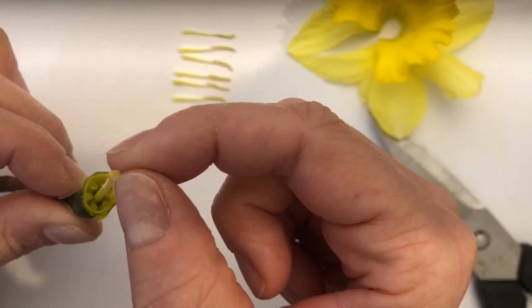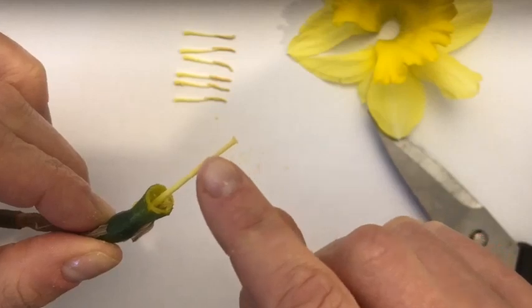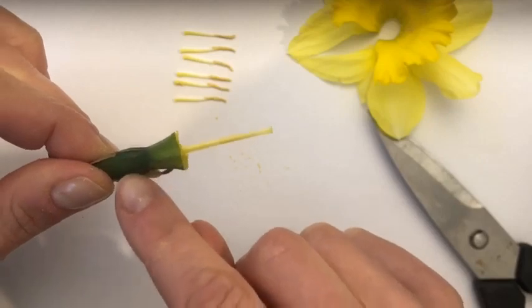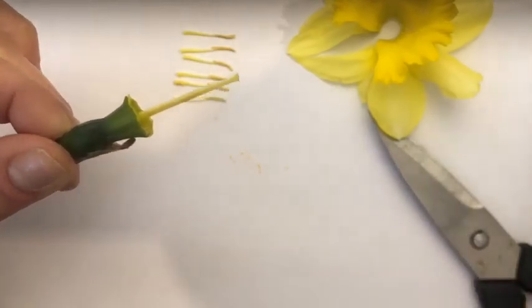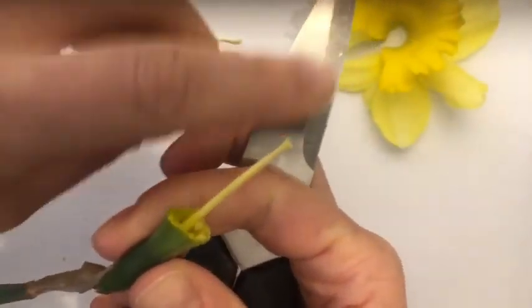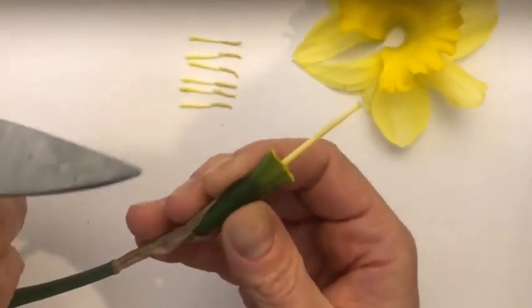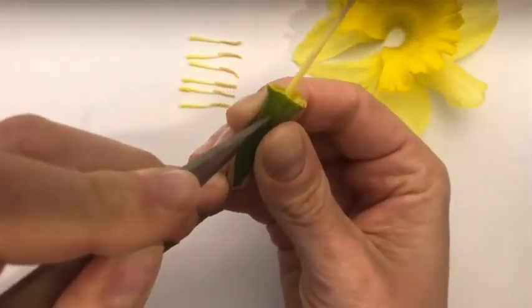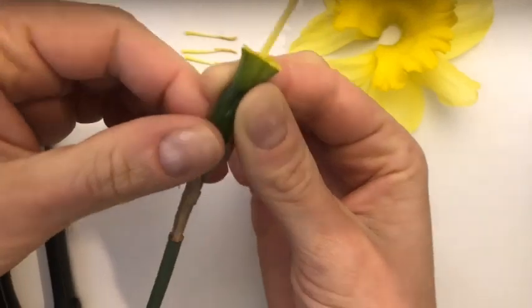Pollen is going to get on top of the stigma, and what happens is that pollen travels through the style all the way down into here — and this is called the ovary. Just like in people, this is called the ovary. What do you think is going to be inside the ovary? Well, if you said eggs, then you're absolutely right. I'm going to take my scissors and give a little slice down through my ovary to see what's inside.